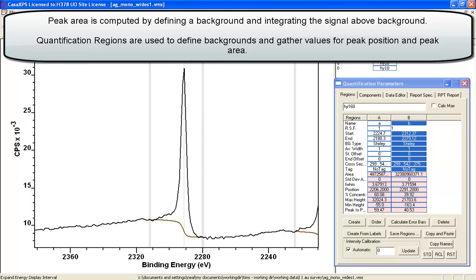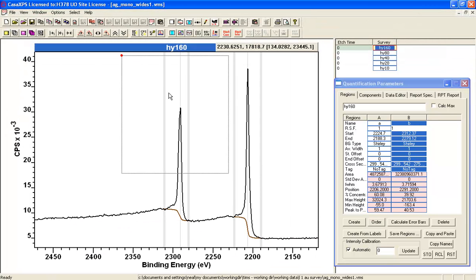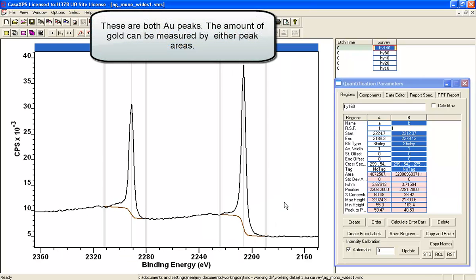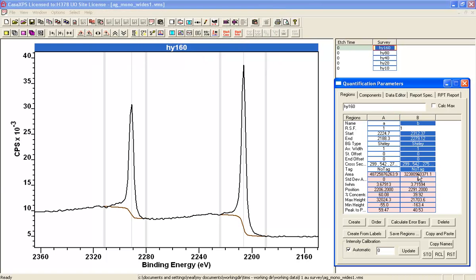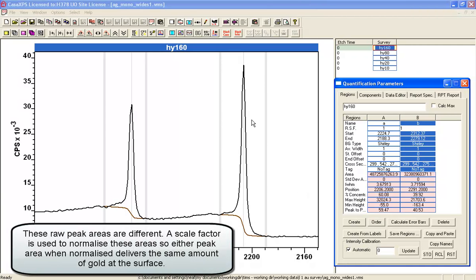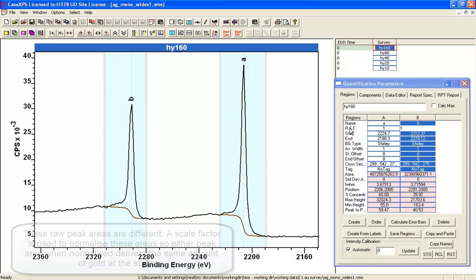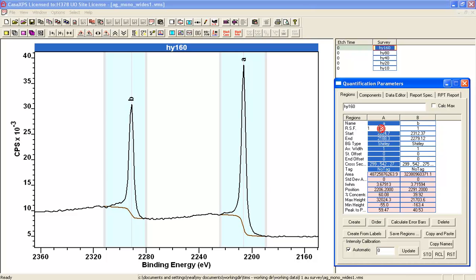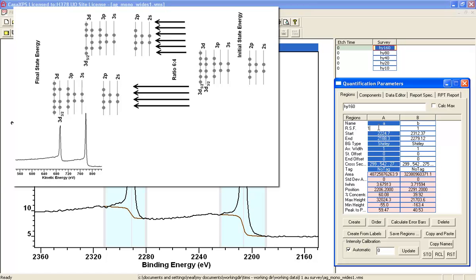And I put these two regions here on the spectra so that I can integrate the area for each one of these peaks. And if I were to use the area of this larger peak, let me just illustrate where that is. If I use the area of A and don't scale it, I would have more gold signal than if I used B. So in order to compensate for this, we introduce relative sensitivity.